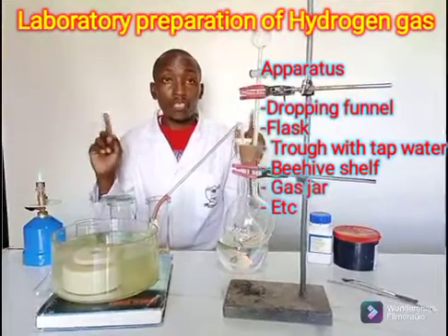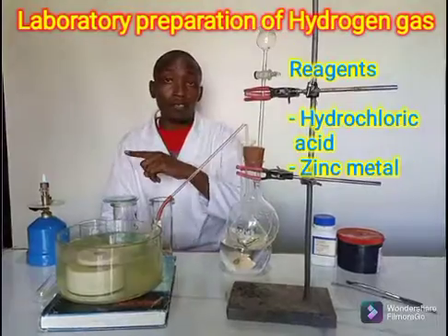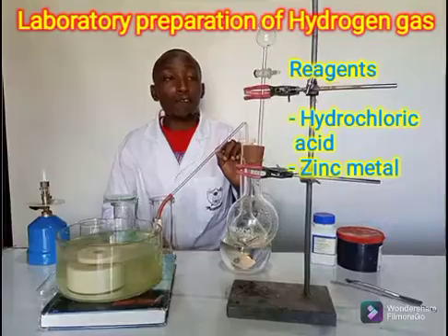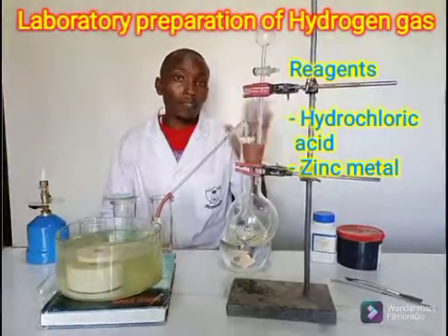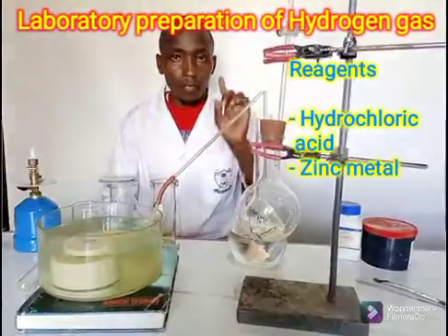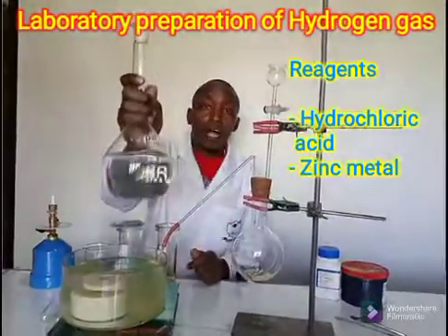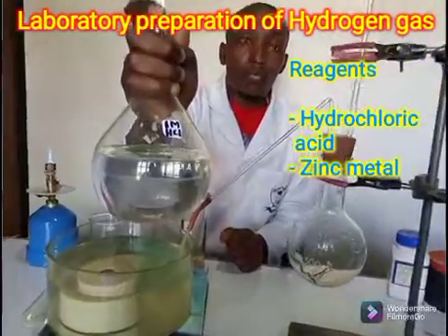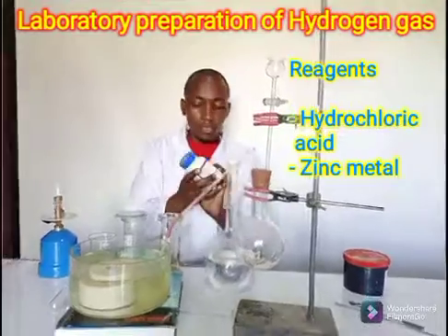I'm going to use two reagents. Generally when a metal reacts with an acid, we get a hydrogen gas as one of the products. Therefore I just need to choose two — one metal and one acid that are appropriate. So for today I will use hydrochloric acid, that is HCl, at a concentration of one molar. And I'm going to use a metal — zinc.